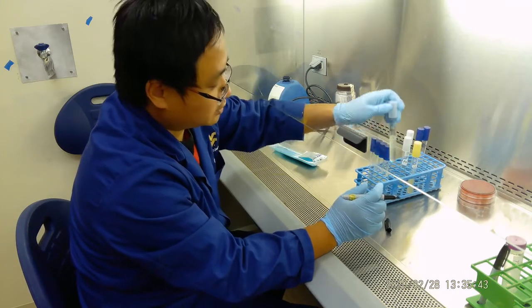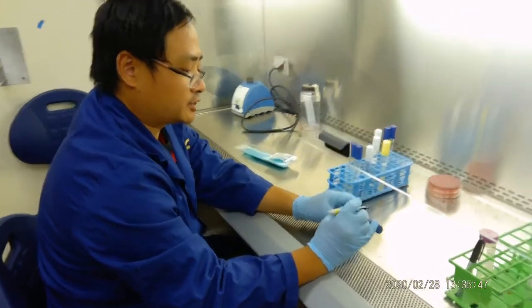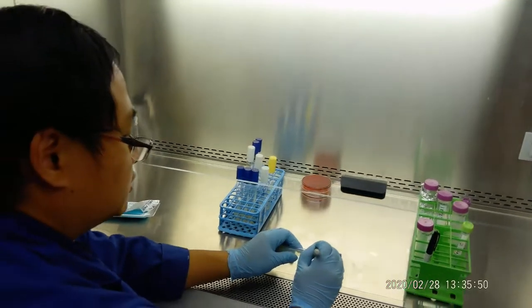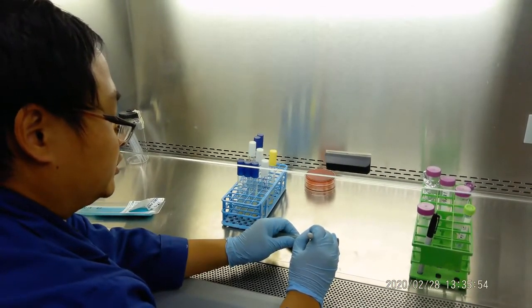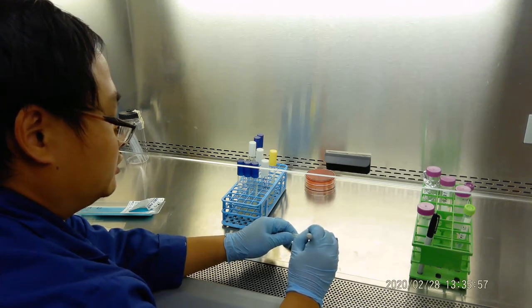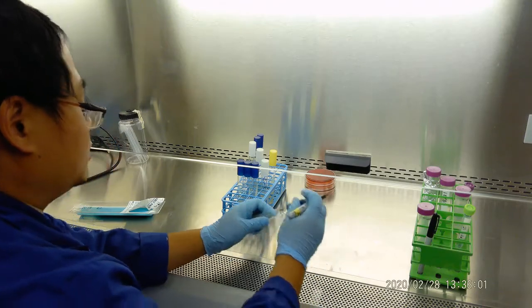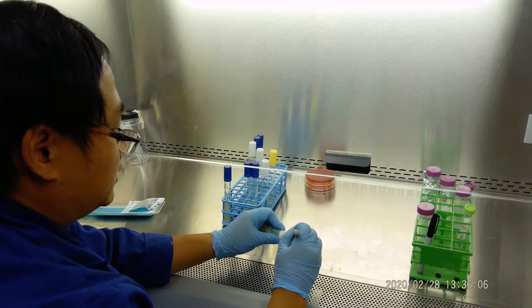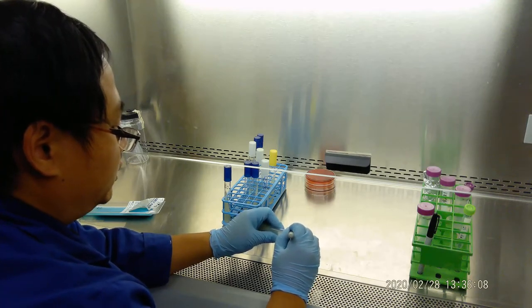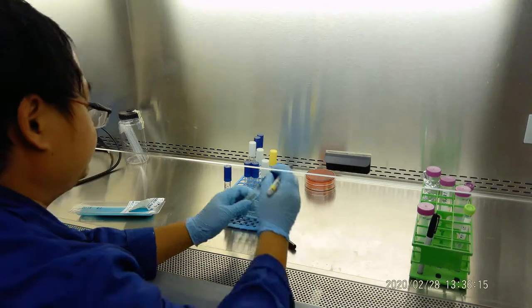So let's say we do E. coli. How do we do it? First of all, you're going to label all these with the temperature. So, to give me a picture, we do E. coli at 4 degrees Celsius, the initial, bench number, and due date. Now the E. coli at 25 degrees Celsius, which is room temperature. So initial, date, and bench number.